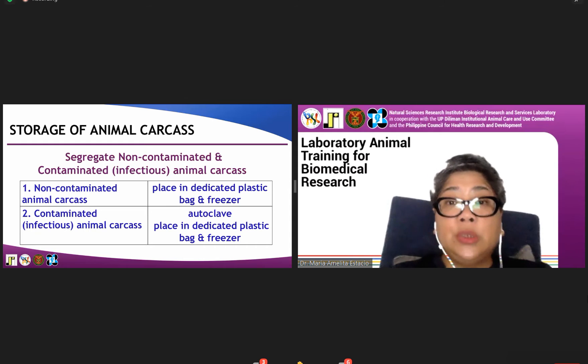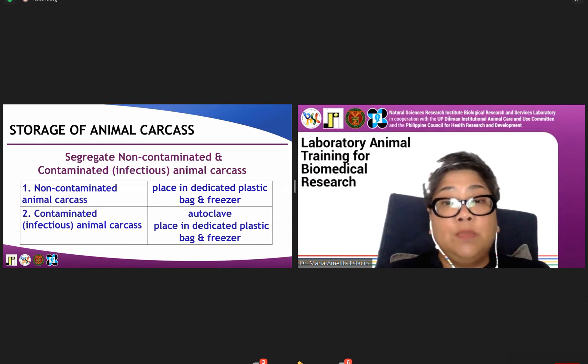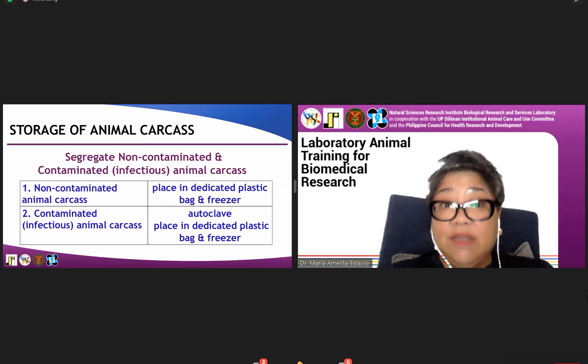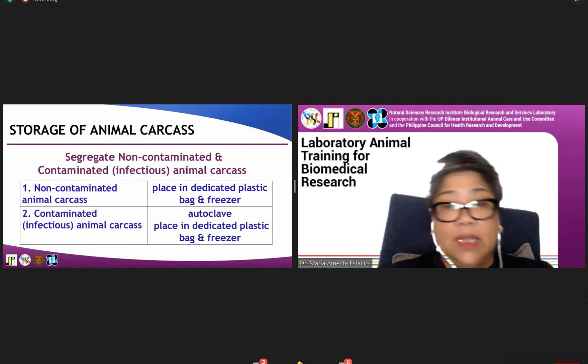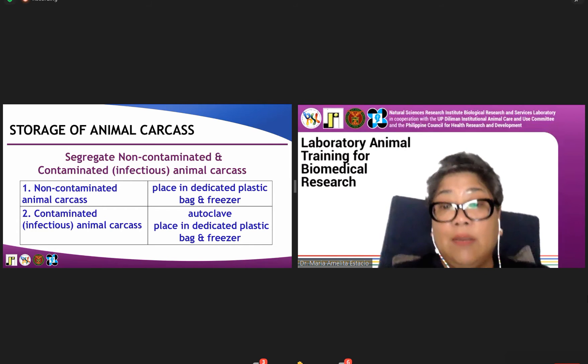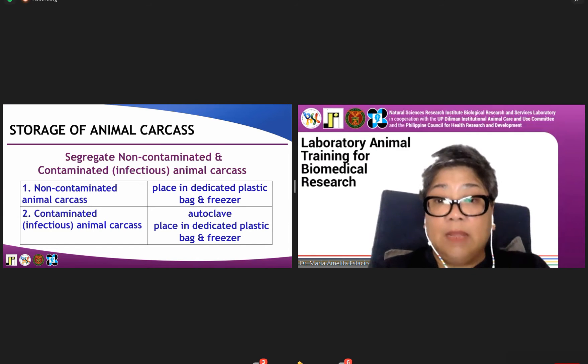For the storage of animal carcass, since we dispose them using a DENR-accredited disposal company, we have a dedicated freezer and we segregate them as non-contaminated or contaminated. The difference is that contaminated animal carcasses need to be autoclaved prior to placing them in the designated plastic bag and placing them in the freezer.